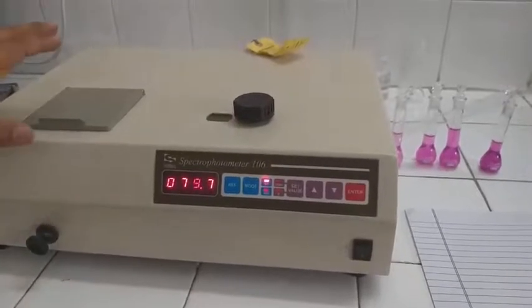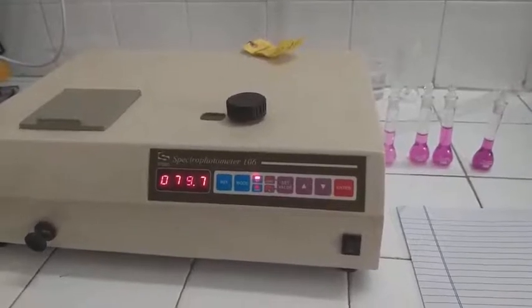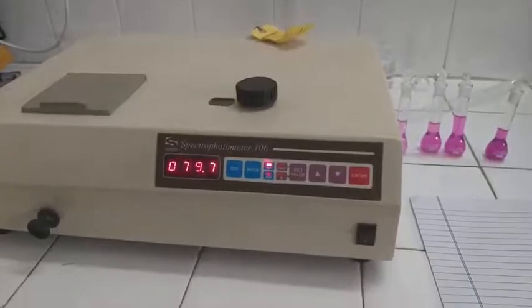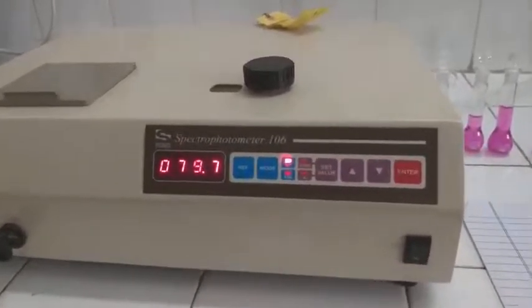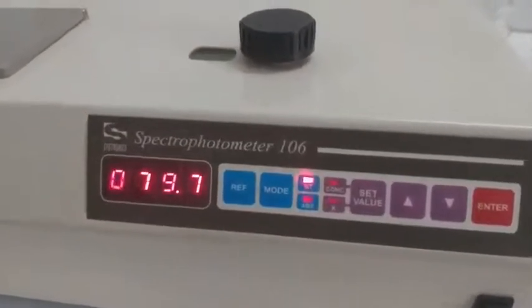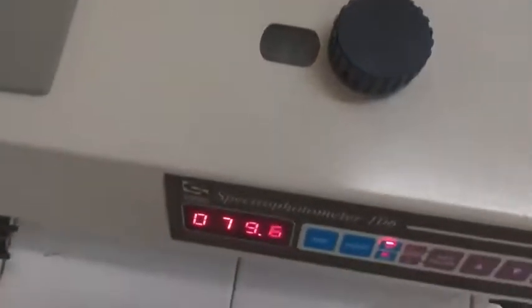This instrument follows Beer-Lambert's law. Beer-Lambert's law is a fundamental law governing the absorbance of monochromatic radiation — the measurement of absorbance of monochromatic radiation by a transparent homogeneous system. On the basis of this law, a large technique employed for measurements by instruments is called spectrophotometry.